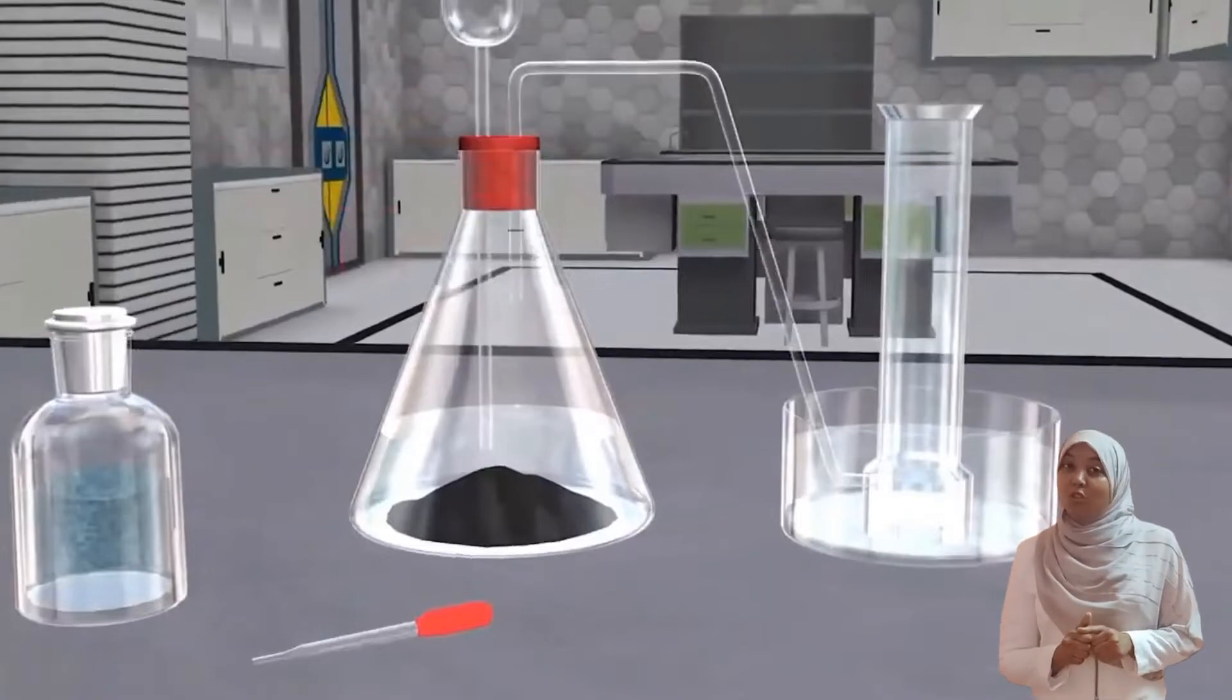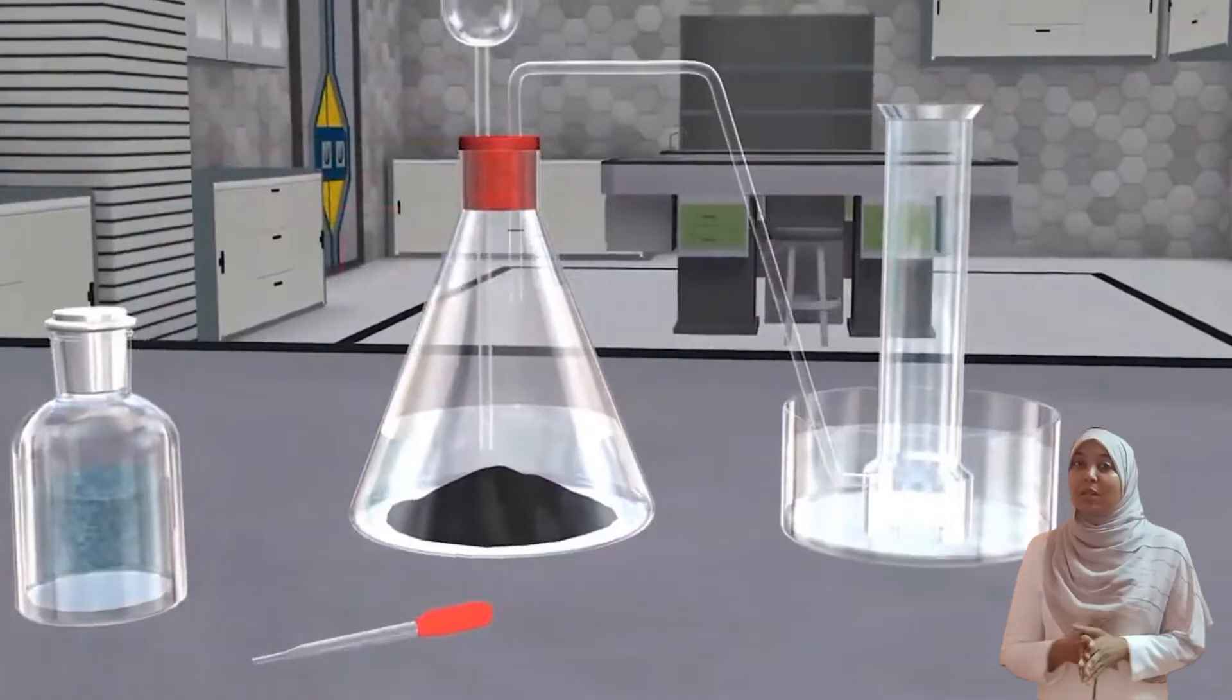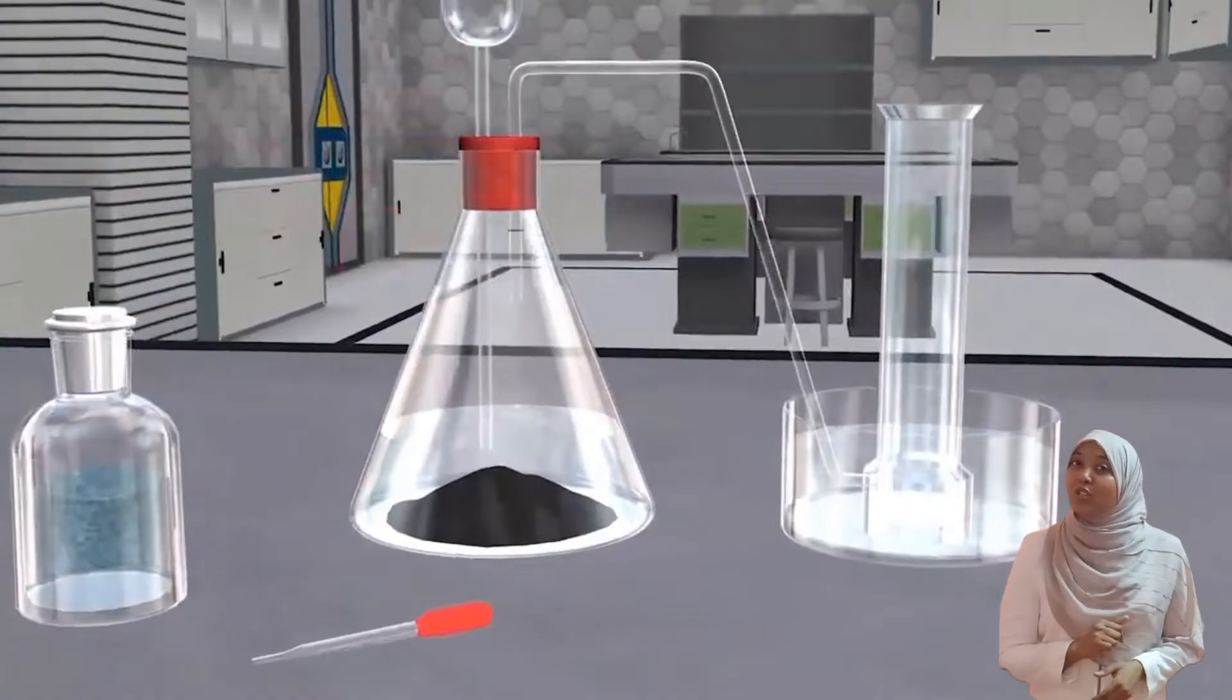Laboratory preparation of oxygen. Oxygen gas can be prepared in the lab through various methods. In our lesson today, we are going to prepare oxygen using two methods: number one using hydrogen peroxide and number two using potassium manganate 7.